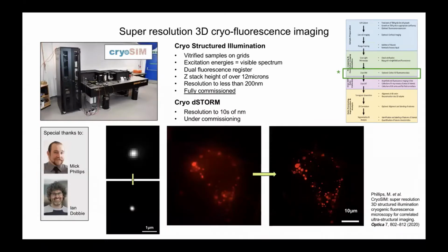And I've stepped over the mapping. So once samples are prepared, we prefer our users to map them in a standard cryo-imaging setting to provide us with evidence that they're good samples. But the most important thing for us, and usually when we see a lot of samples coming in, is the super resolution fluorescence imaging. Now, fluorescence imaging will always have to precede X-ray imaging because we don't want to damage the fluorophores.